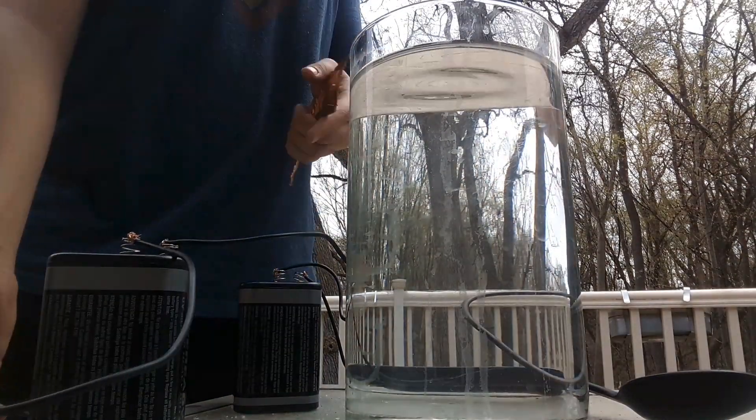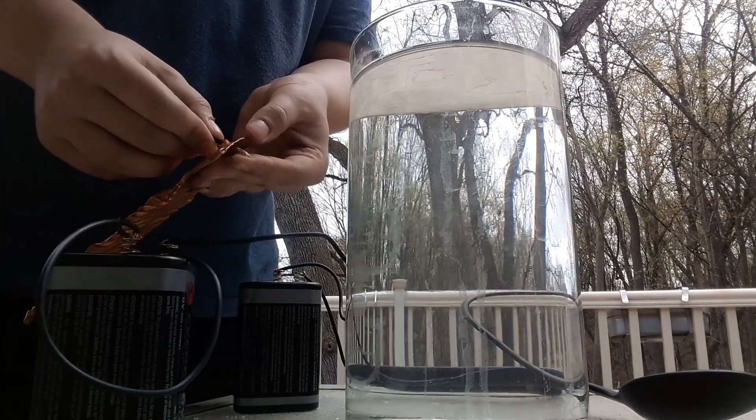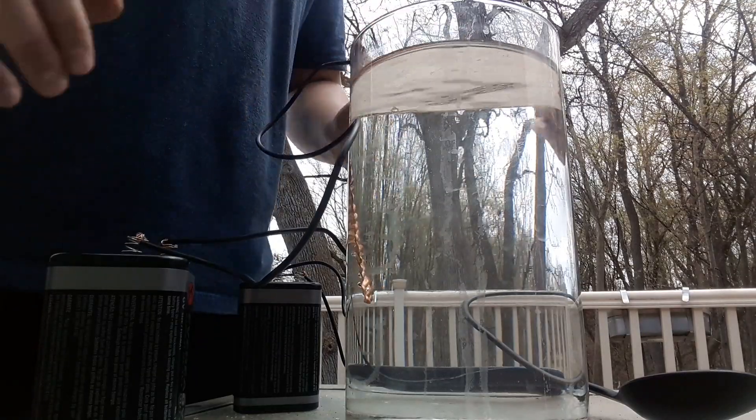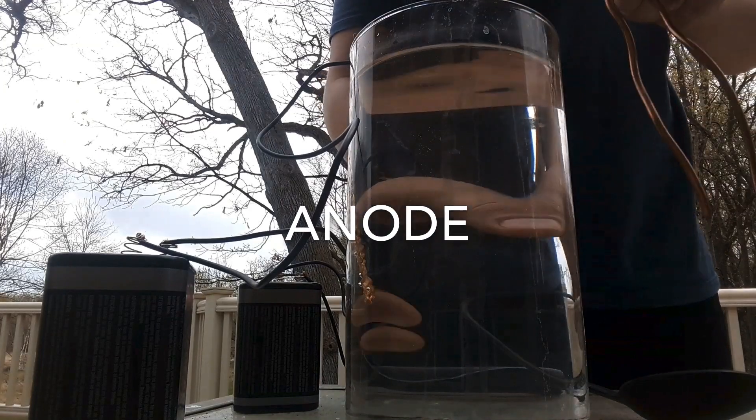Now we're going to use our copper and hook up the negative side to the flatter one, just like that. Put it in the water, and we're going to hook up our positive to this one.